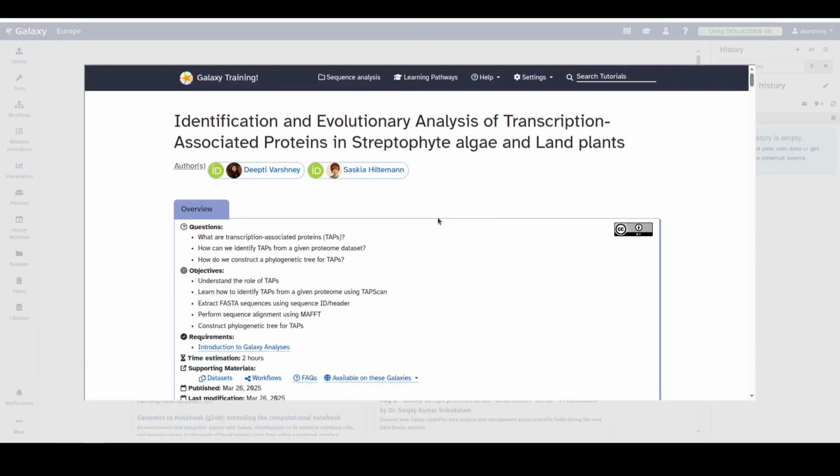For that we will use the output from the cut tool and ask to remove the first line, which is our header line, and just click on Run Tool. This will remove our header line in which we have this sequence ID written. Yes, so right now it's running.